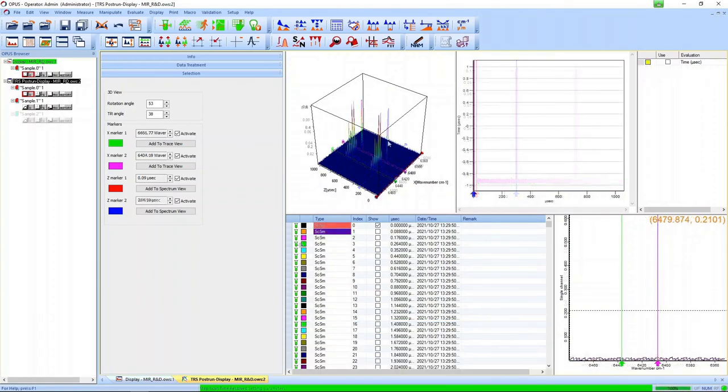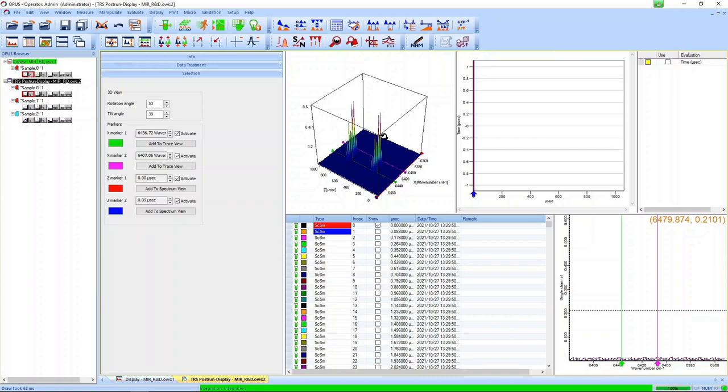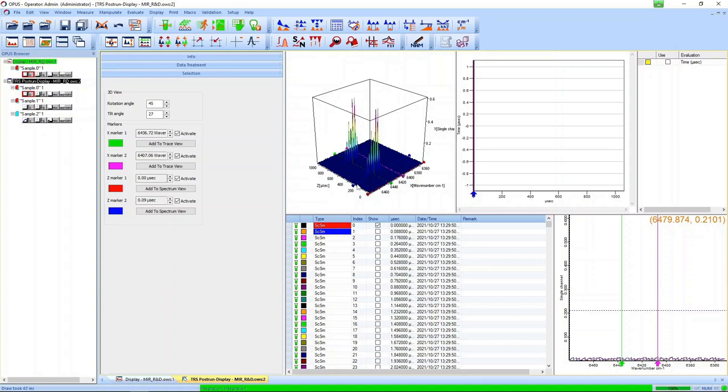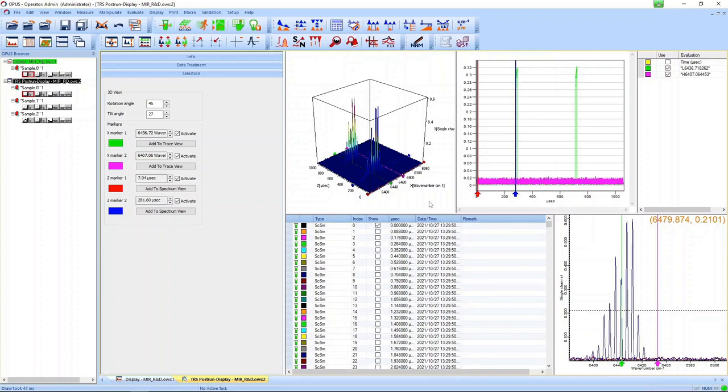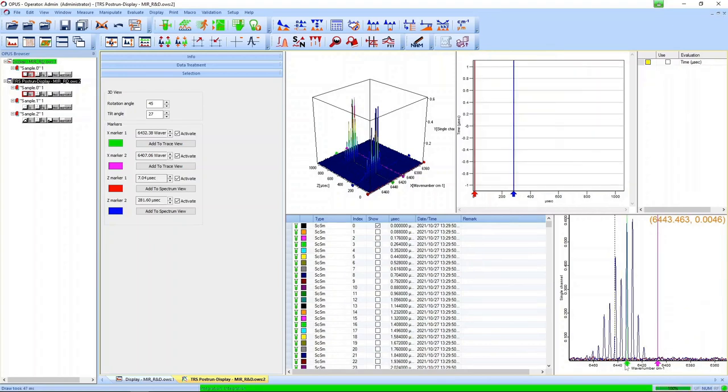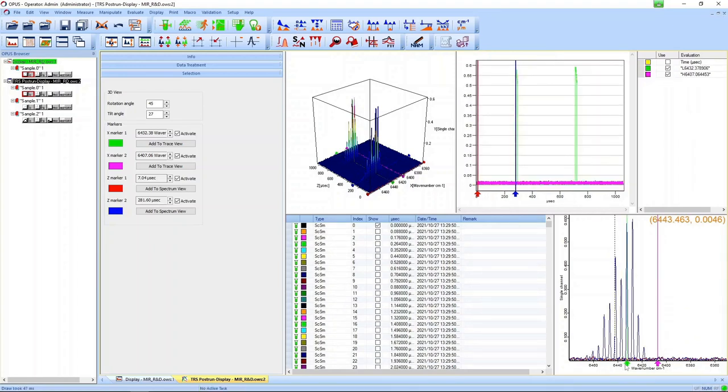We accelerate this again and see that we can now resolve individual laser modes in the spectral domain. In the lower right corner we see several individual laser modes. In the temporal profile we can again see a plateau of the pulse because we kept the high temporal resolution in this measurement.